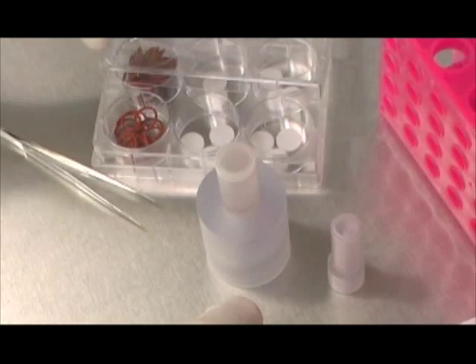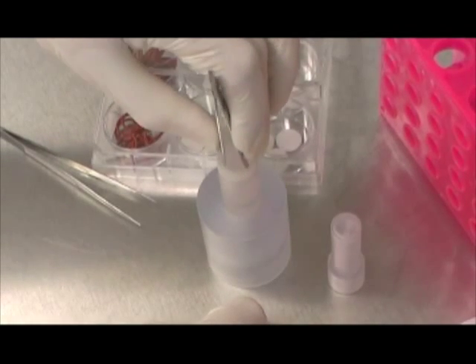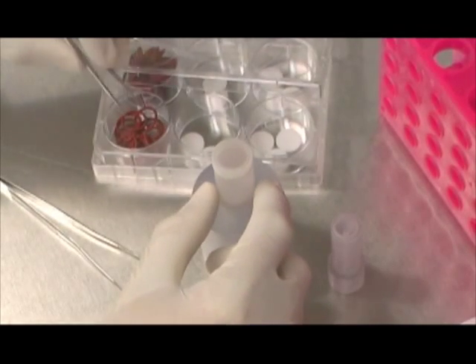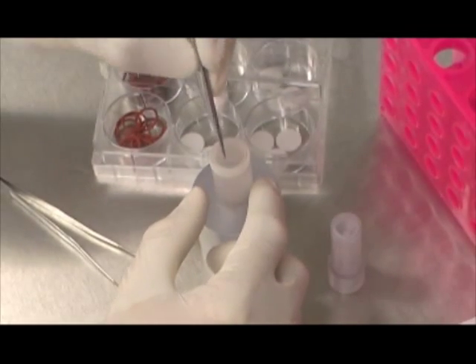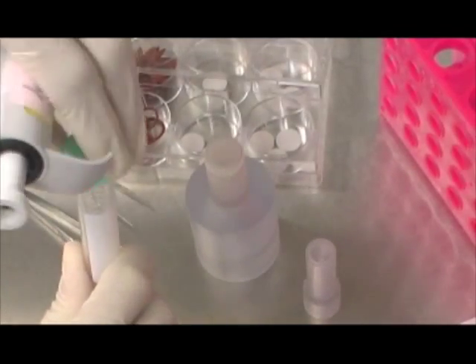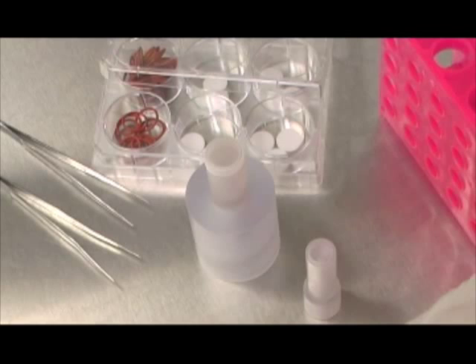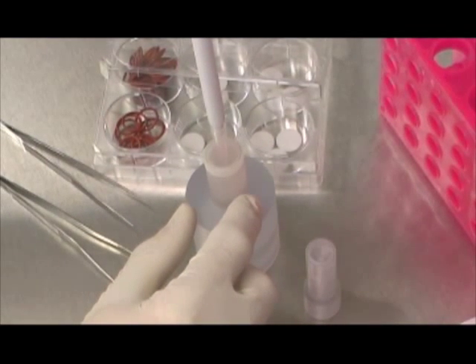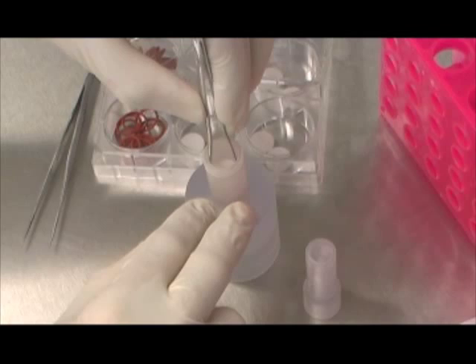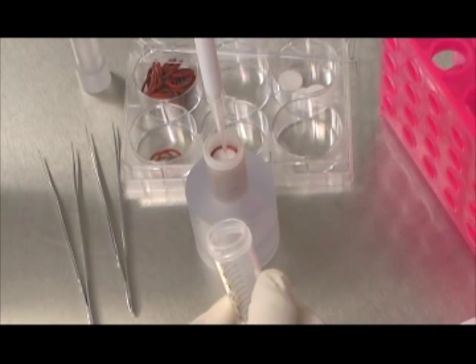First, grab a scaffold along its diameter and carefully lower it into the bioreactor chamber. Second, place an O-ring using the O-ring pusher to lower the O-ring with downward circular motions. Third, using a pipette, dispense the exact cell suspension volume into the center of the scaffold. Lastly, load another scaffold into the bioreactor chamber. The loading sequence — scaffold, O-ring, cell suspension, scaffold — has been optimized to make the cell seeding process user-friendly.